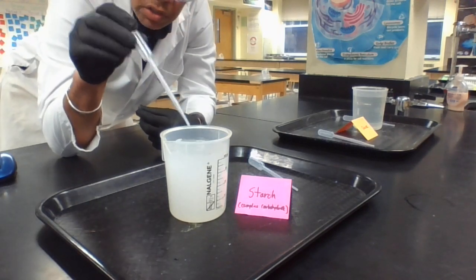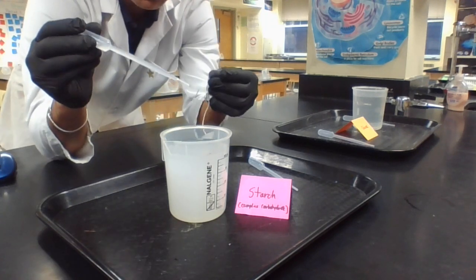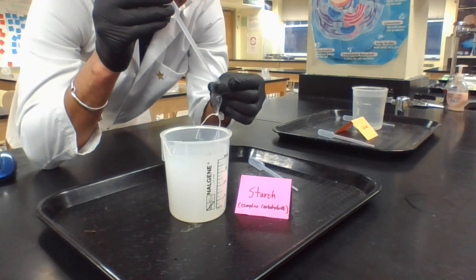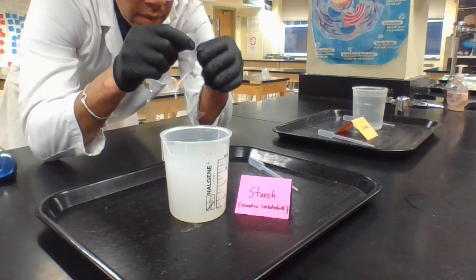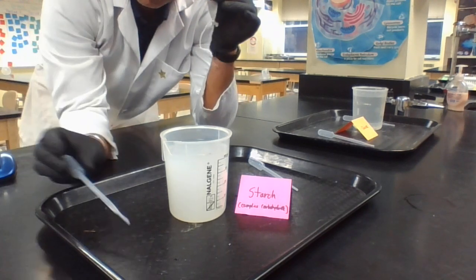And so this is cornstarch. What you need to do is take a full pipette. Okay, so I sucked up as much as the pipette was able to draw up, and I add it to the bag. Okay, so that's about half full right now, which is enough.